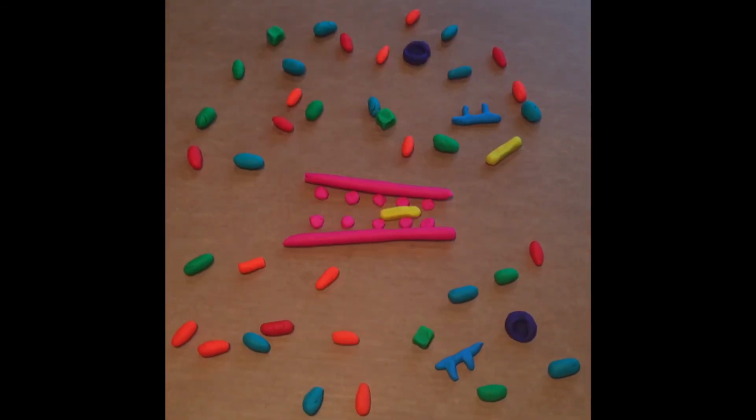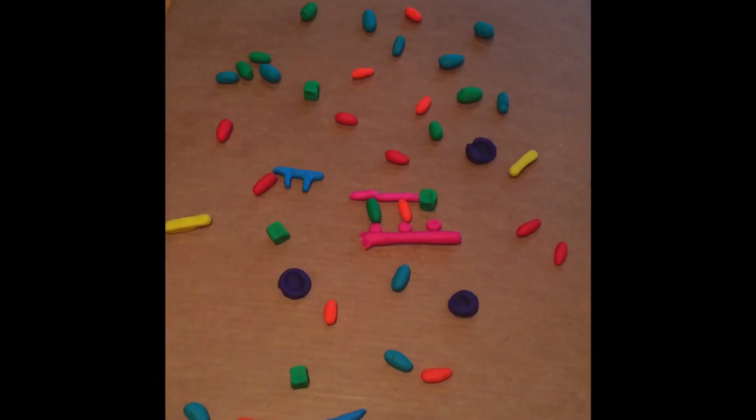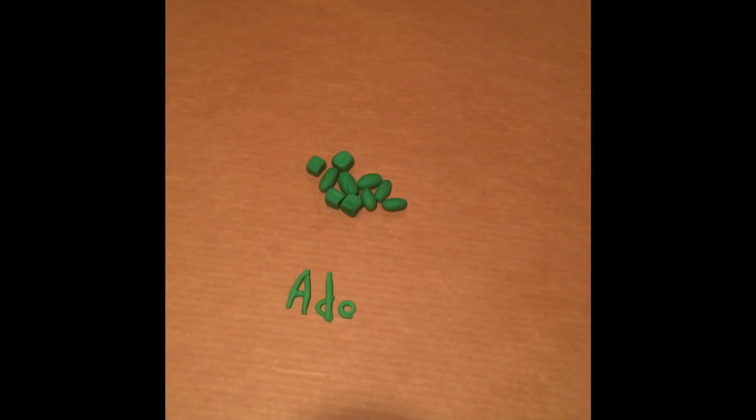Here's the Sanger method again, in real time. As there are many copies of the DNA in this solution, after the reaction they have varying lengths due to the random placement of the DDNTP. This reaction, for example, contains adenine DDNTPs. This means that the terminations will always occur at an A in the sequence.